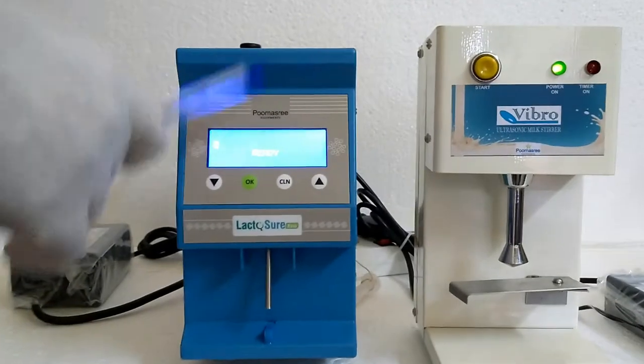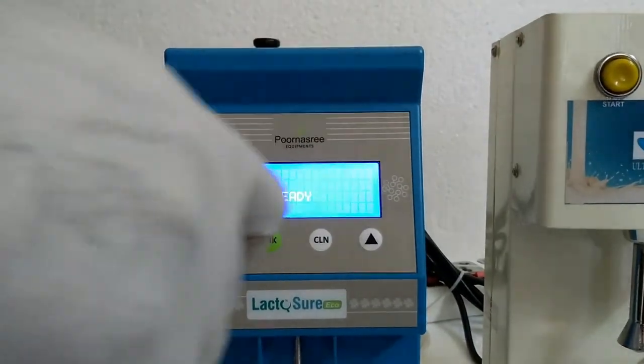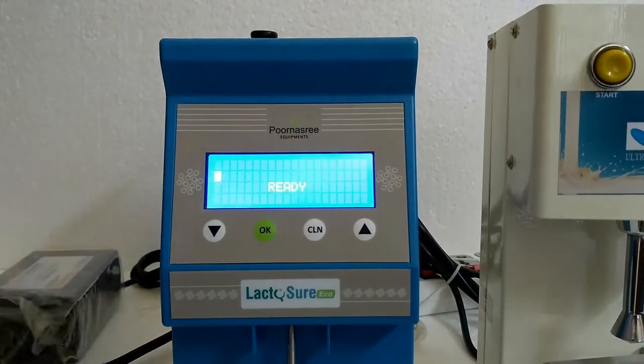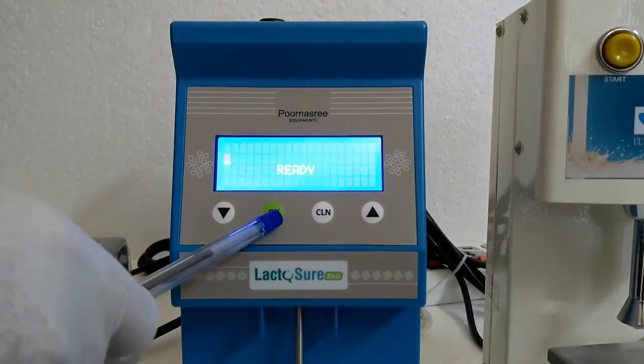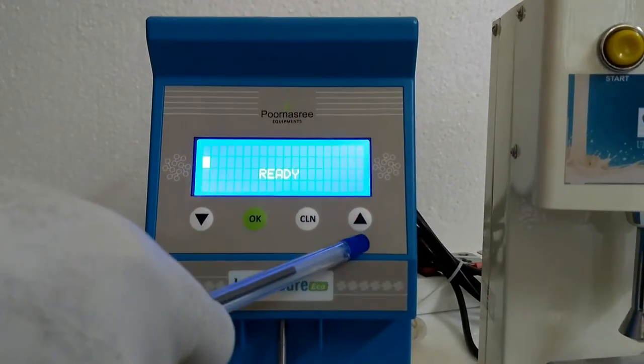Now the front panel of the LactoSure Eco. This is the 4x20 character LCD display. This is the down button, this is the OK button, this is the cleaning or exit button, and this is the up button.